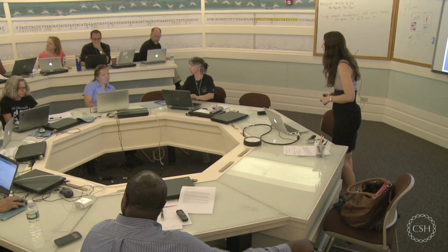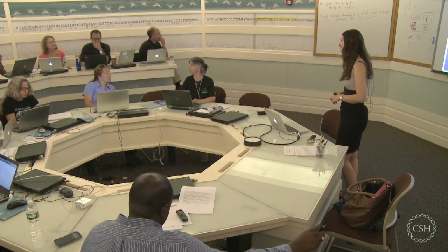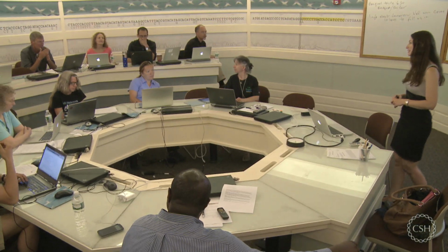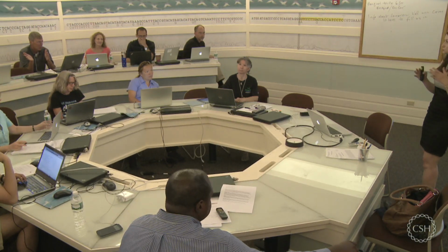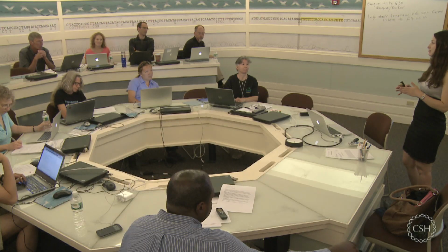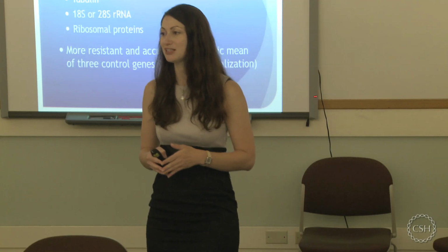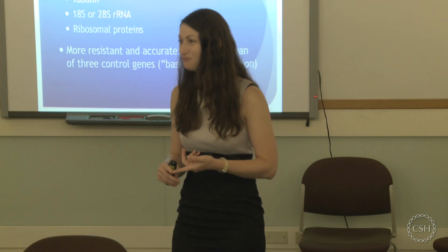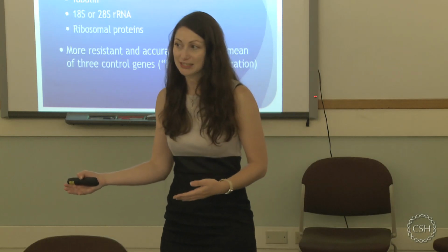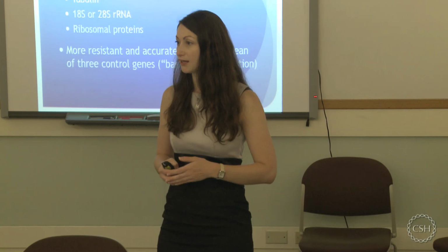My intuition is often wrong, and so far it's here too. I would guess that in an ideal world, your control gene would have a CT value, say, midway between your control and your treatment. Yes, so it's always best to choose your control gene with a similar CT to your target gene. It should be at least in the same range of, let's say, 2 to 3 cycles in either direction, that's fine too. And obviously if you do a knockout, you have like no target gene in one case or maybe 10% left, then you can't do that. But then you would go for the normal expression in normal tissue.